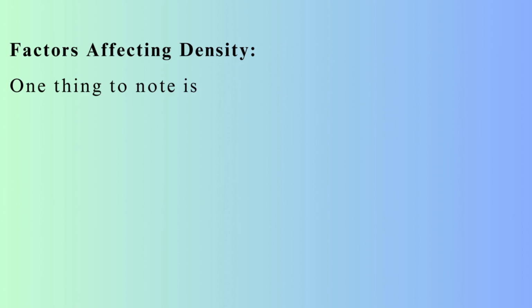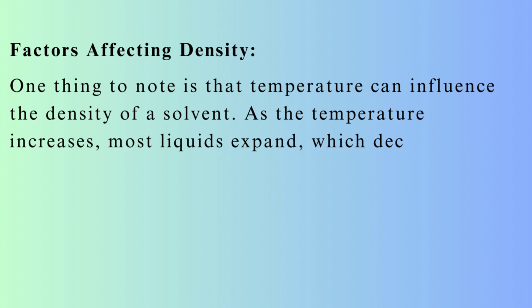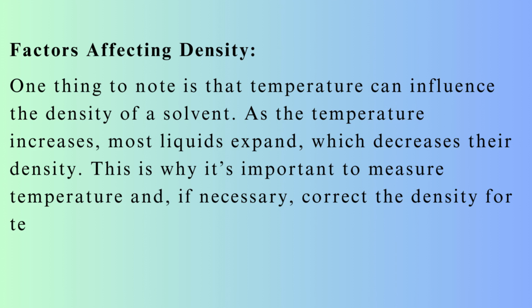Factors affecting density. One thing to note is that temperature can influence the density of a solvent. As the temperature increases, most liquids expand, which decreases their density. This is why it's important to measure temperature and, if necessary, correct the density for temperature variations.